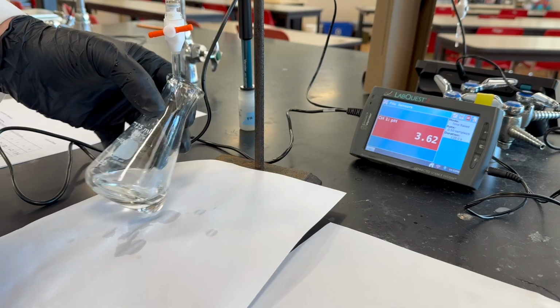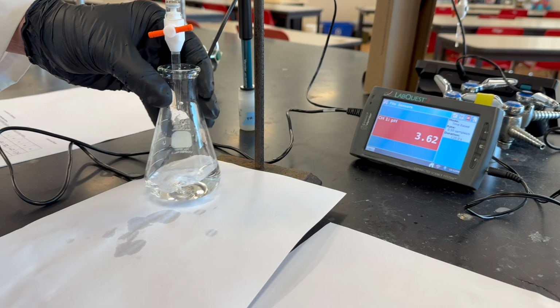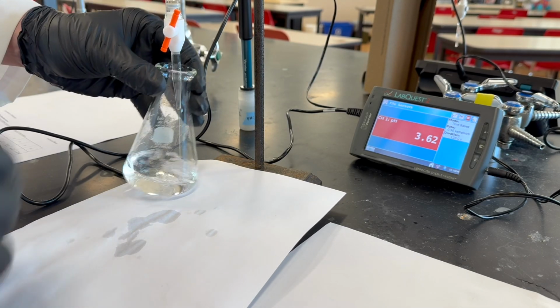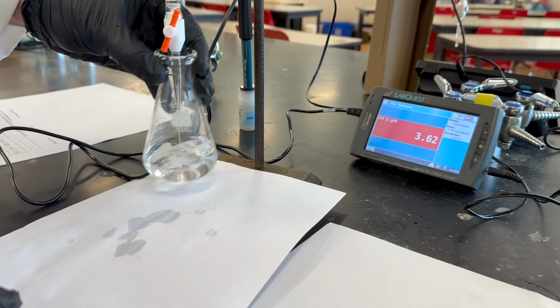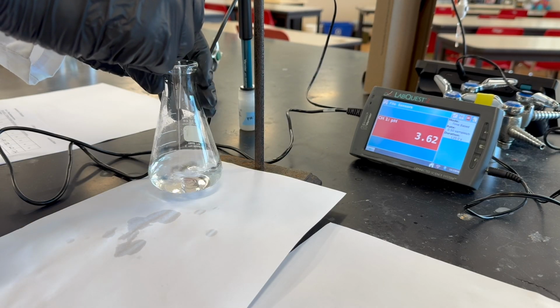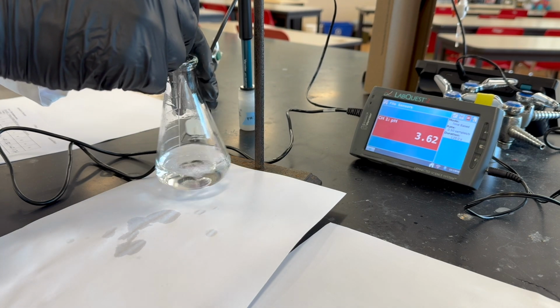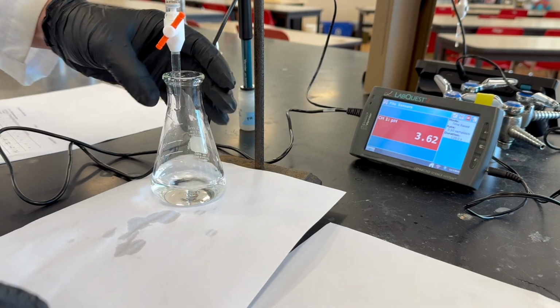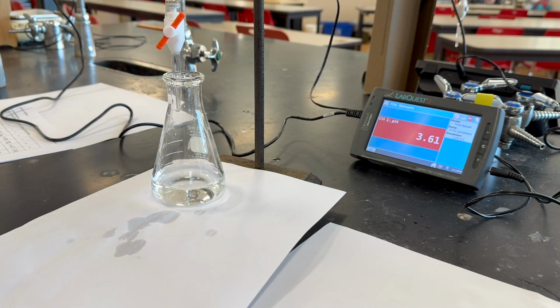As always, we're going to swirl the Erlenmeyer as we add the base. And we can go relatively quickly at first because we know that we're not going to be anywhere near the end point, or the equivalence point, I should say. But as we get closer to maybe around 18 milliliters-ish here, we're going to slow down and proceed more carefully.